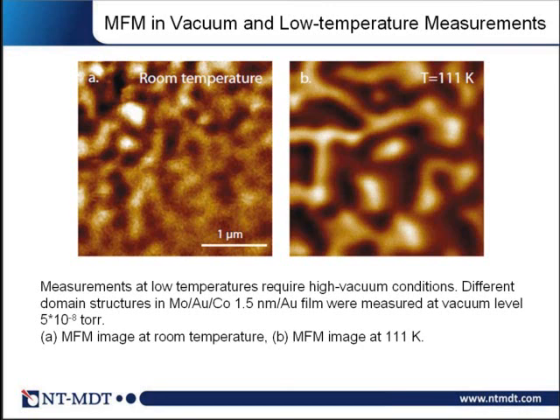physical reason for the difference in these two images is the properties of the sample which is investigated here. Here you see that this is a multilayer, and the magnetic part of this multilayer is cobalt, very thin cobalt film. And its properties strongly depend on the temperature, for example, domain size. These changes of these properties also contribute to the changes between these two images.